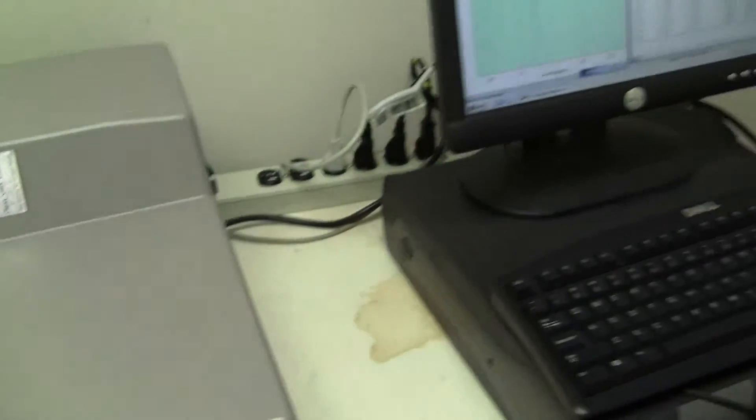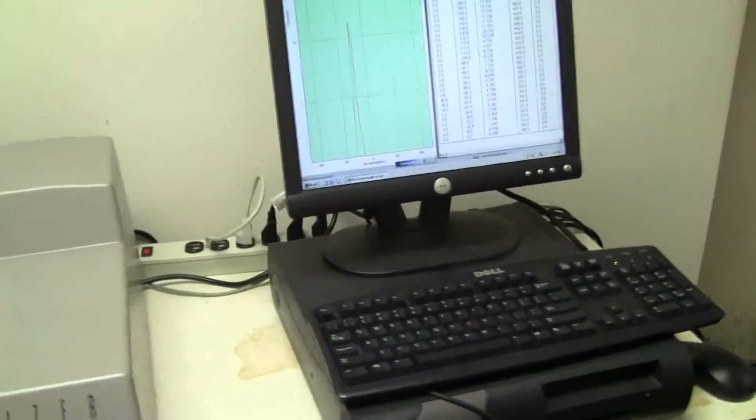RS-232 communication is the communication style of this particular instrument.